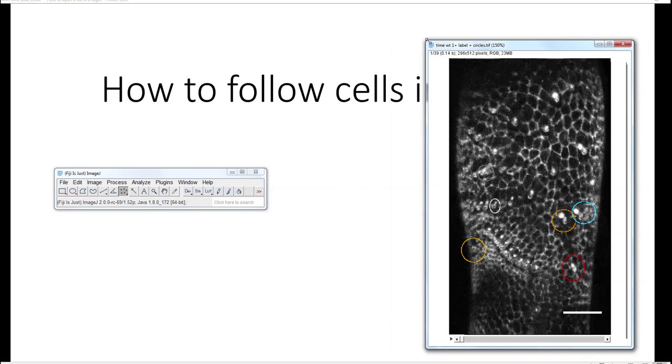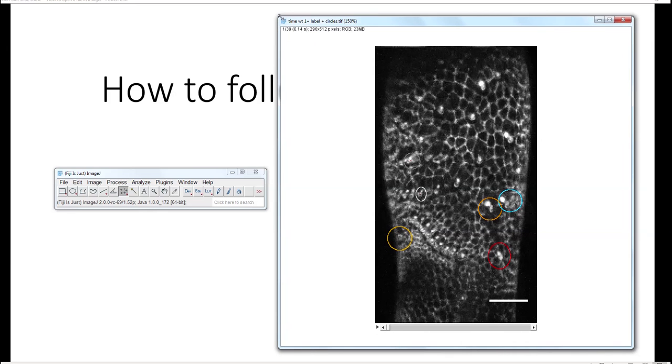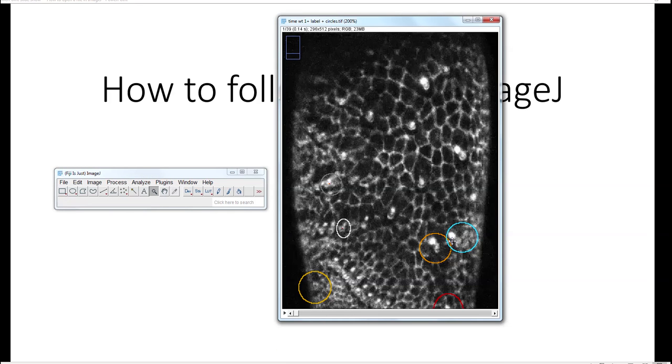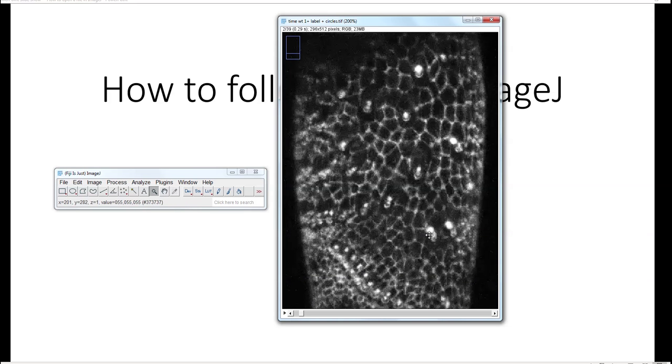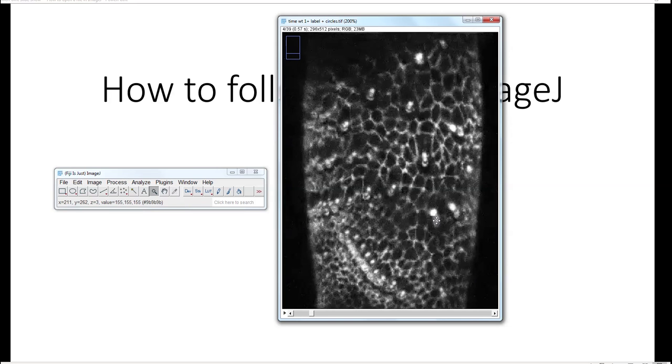As big as possible. You left click and drag, and then you can use zoom. The idea, for example, if we want to measure the cell inside this circle, or the cell in the orange circle, you can see that it's this bristle, and now it's this one, and now it's this one, and now it's this one. So it's moving very slightly and it's very easy to follow.